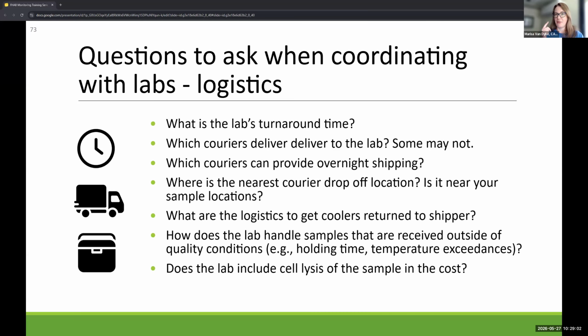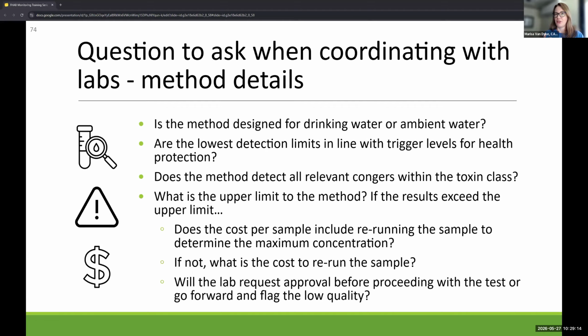Your colonies, the scum, the mass, and you want that to be broken open so you can get a measurement of all the toxins that are in your sample, both what was in the water that was collected and in those particulates. And most laboratories, the standard approach, have that cell lysis. That's just standard that they will do before they measure for toxins. So it's something good to check, especially for some research laboratories and such. They give you those options.